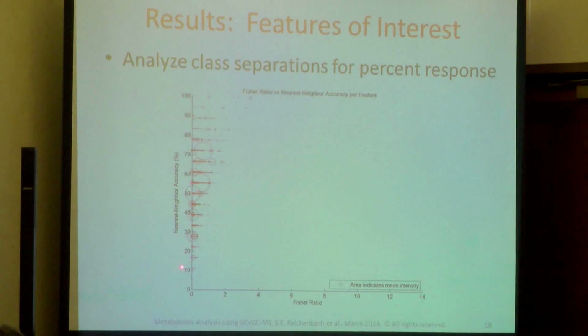And so you can have high Fisher ratios, but it might just be apparent that there's a large difference when really there isn't. So what we're looking for is things that are up in this region, that they're valid and there are large differences. And I think maybe you can see one there. I don't know. As I say, I apologize. This slide is pretty washed out.